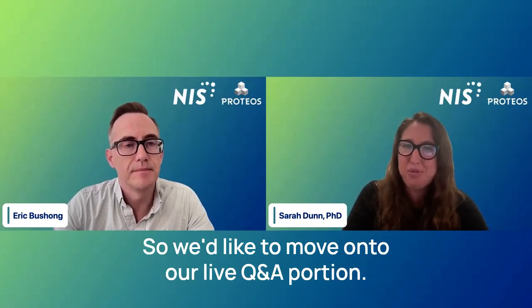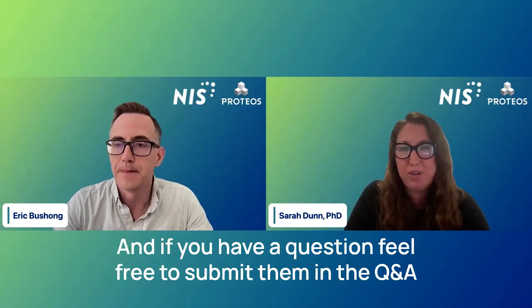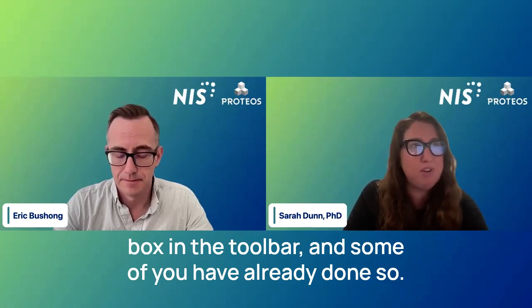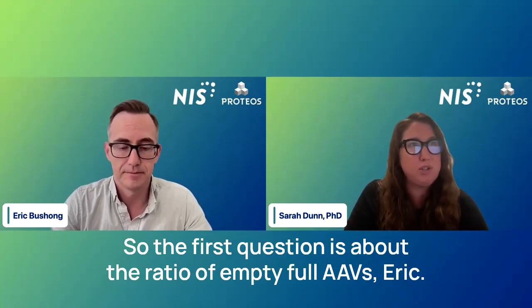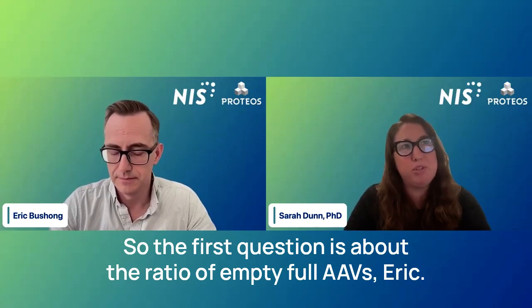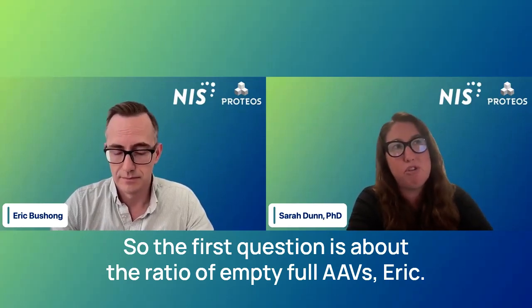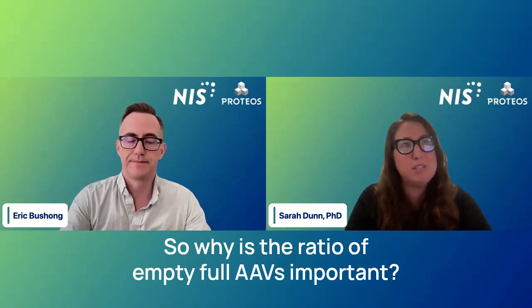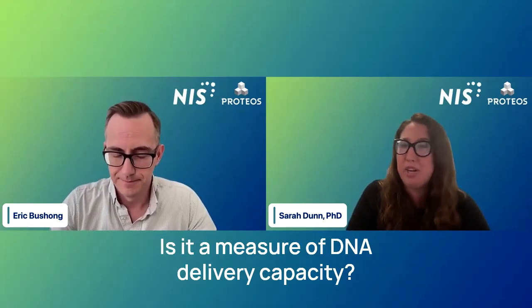So we'd like to move on to our live Q&A portion. If you have a question, feel free to submit it in the Q&A box in the toolbar. Some of you have already done so. So the first question is about the ratio of empty to full AAVs. Eric, why is the ratio of empty to full AAVs important? Is it a measure of DNA delivery capacity?